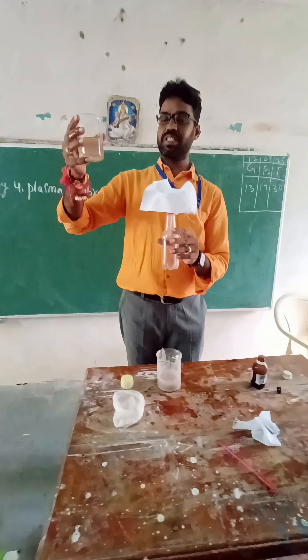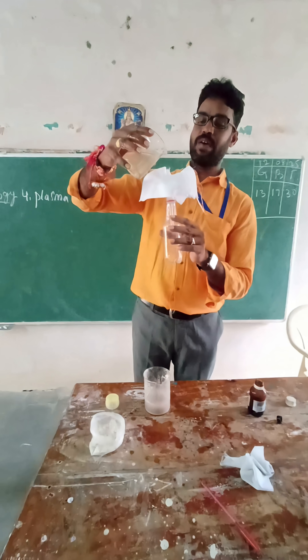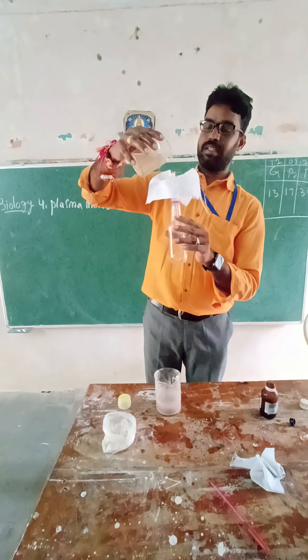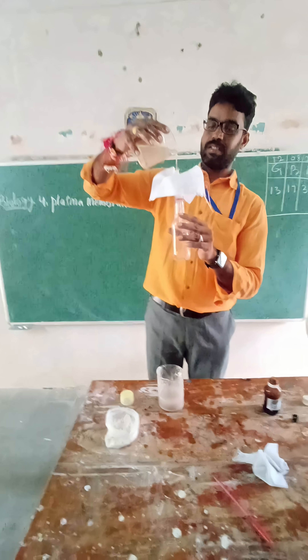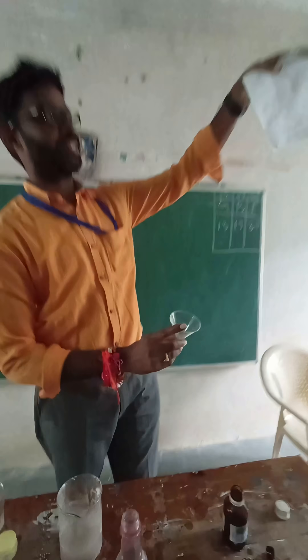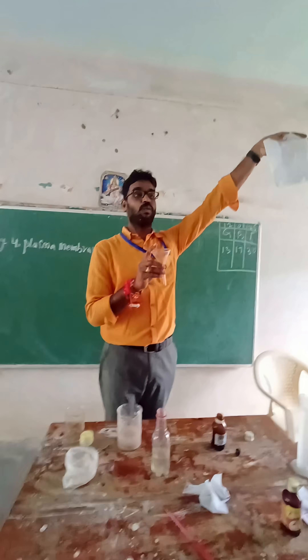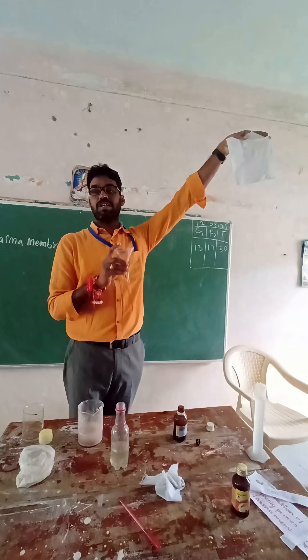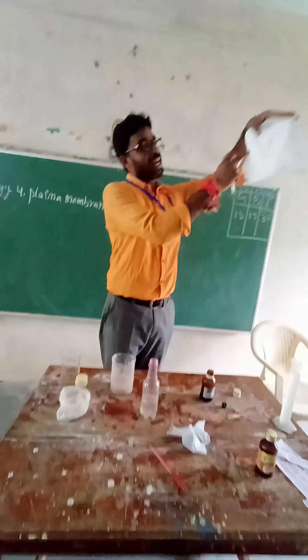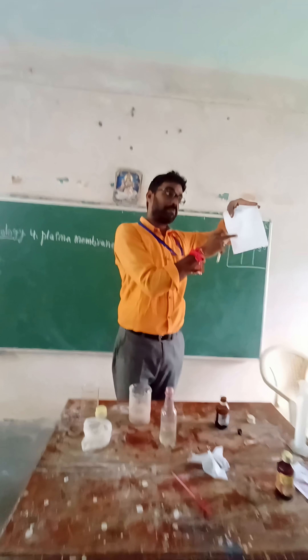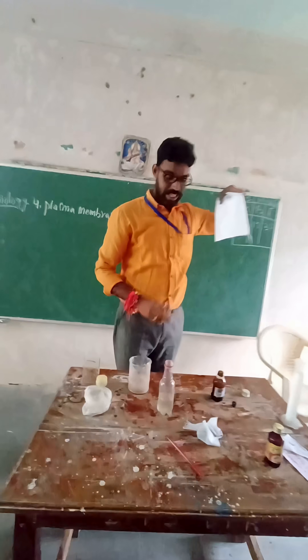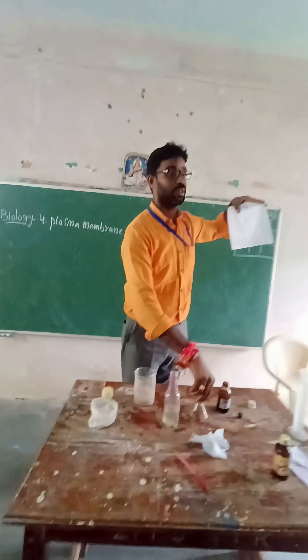Now we pour the sugar solution into the funnel. We observe that there are no sugar particles remaining on the cotton cloth — sugar is dissolved in the water, so it passes through. The plasma membrane allows only certain solutes to pass through.